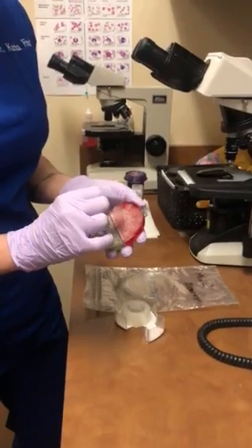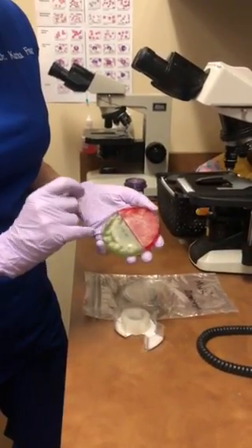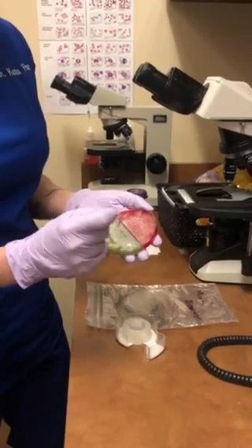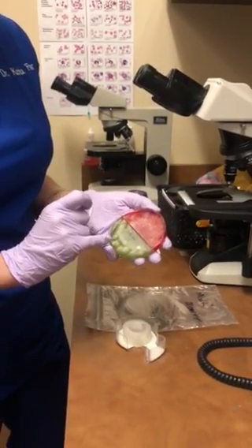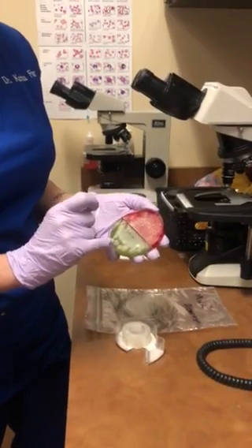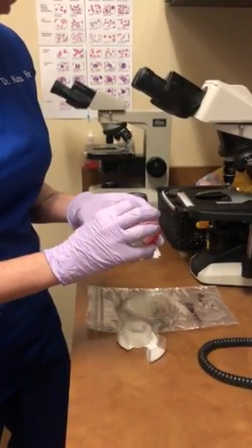This is a combined plate — it has rapid sporulating medium and then your regular DTM. If you have the rapid sporulating medium, that's the best. If you don't have a plate with this, then the regular DTM is just fine.